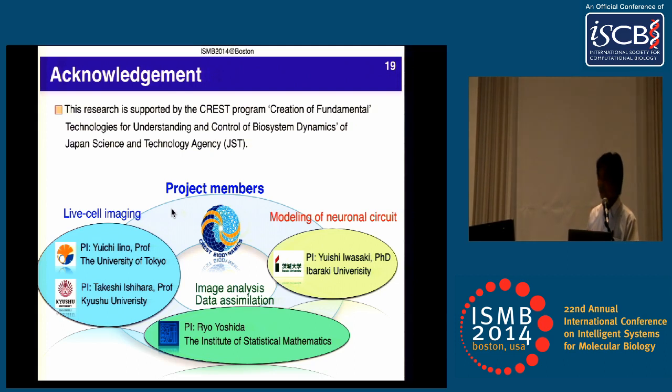We are thinking about it. It is possible. We think the simplest way to detect merge and division is to perform cell detection for every frame. Now we detect the position of cells only at the initial frame, but we can detect for each frame. So this is a simple idea. But of course, I'd like to develop a more sophisticated way in future work.